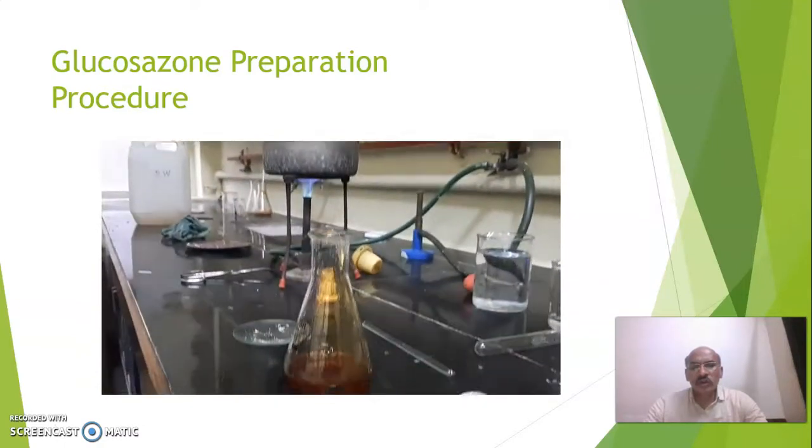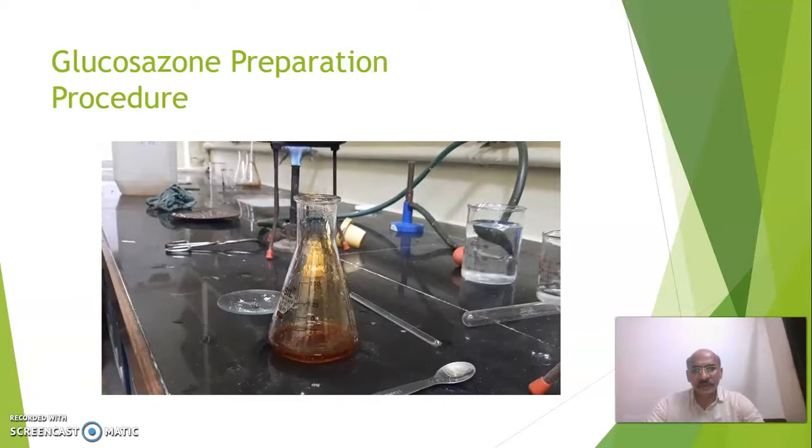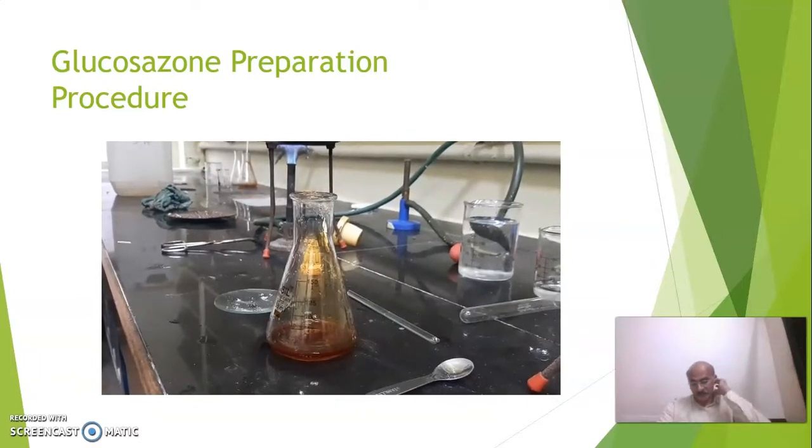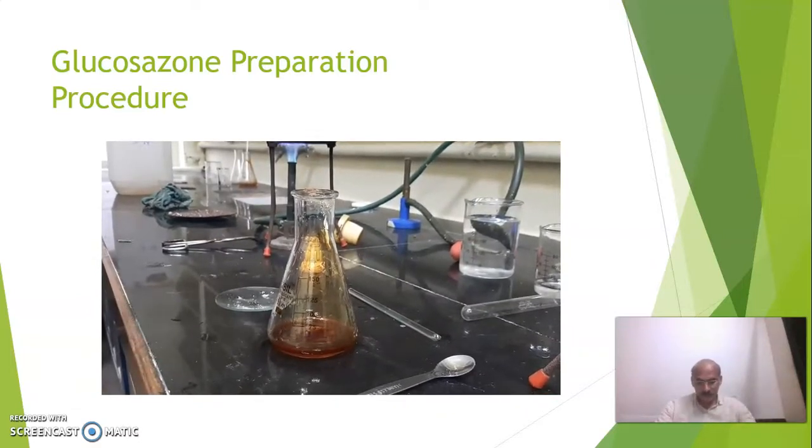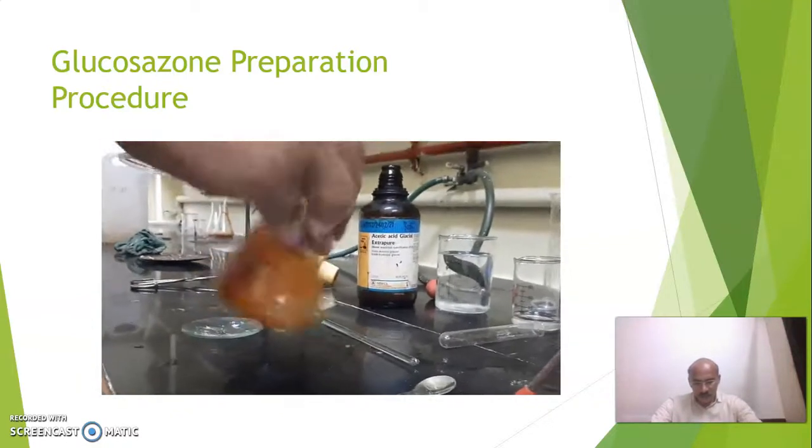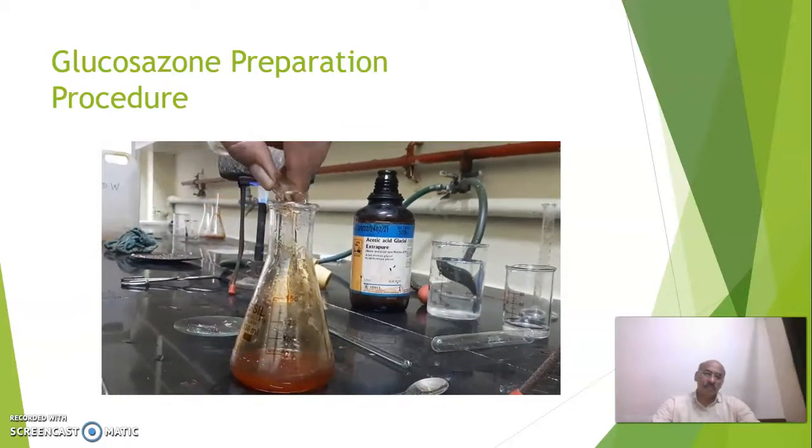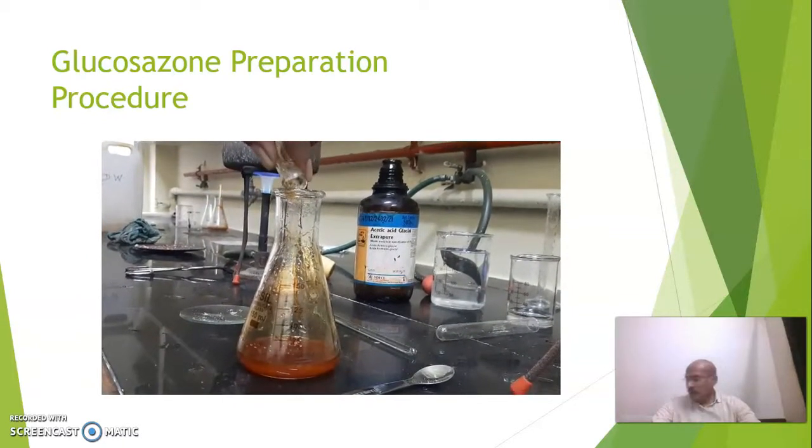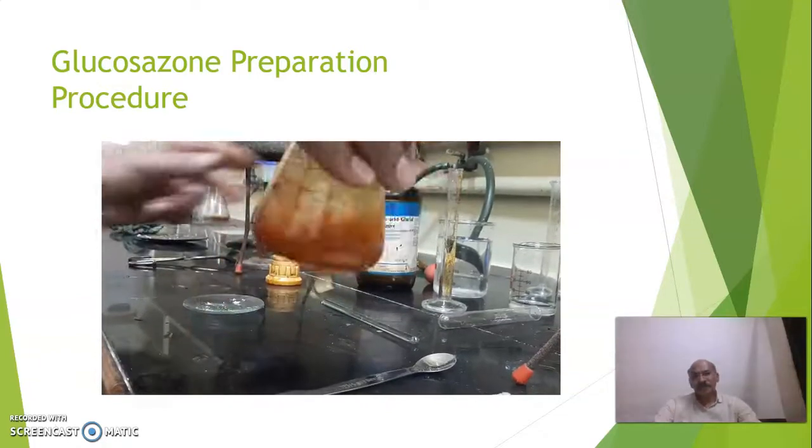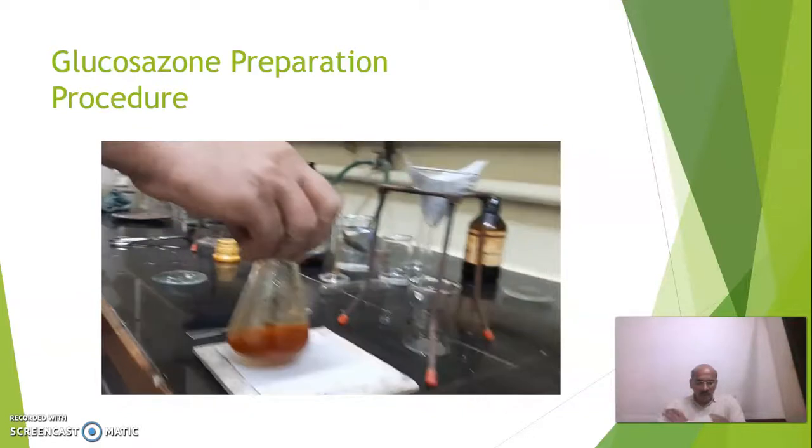Around 6 cm cube of glacial acetic acid we have to use. We will shake it and we will keep it in boiling water bath for heating.